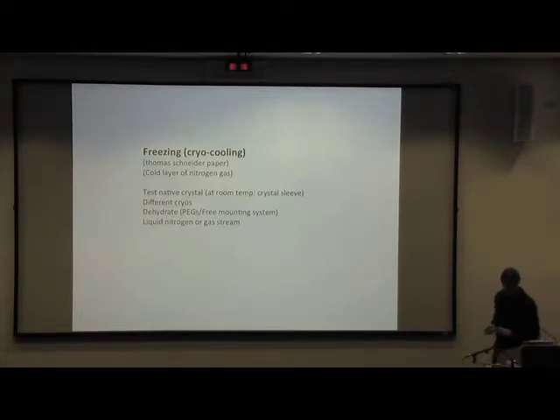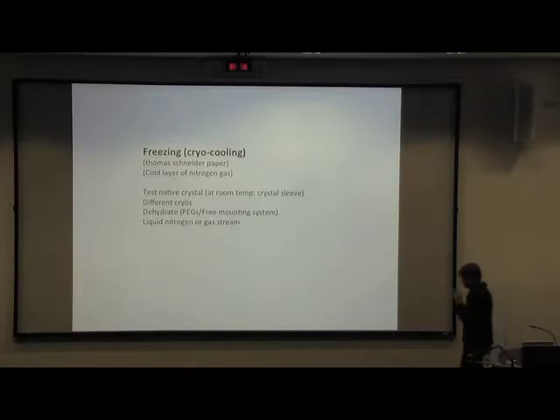So now we get to freezing. I had a lot of cool things here, but they're all gone now. I lost it. But it's actually cryo-cooling, because we're not wanting to freeze it. If you freeze your crystal, what you get is ice crystals, and they'll diffract like crazy, and you won't see the protein diffraction at all.